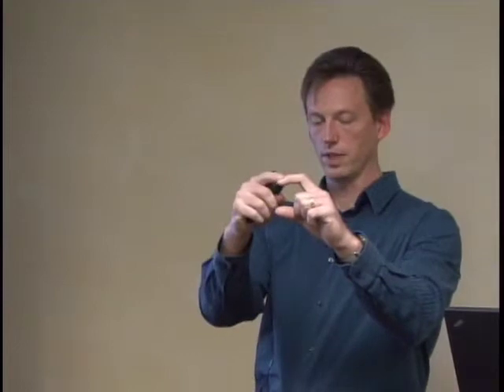Because one person could have a C to a T difference relative to person one, and then somewhere else within the amplified region, it could be a T to C, so it could go backwards. And then you get compensating mutations, and you get the same base composition. So the question is, if we look at a bunch of sequences, what does the resolution look like relative to sequencing, in terms of can we differentiate two samples or not?